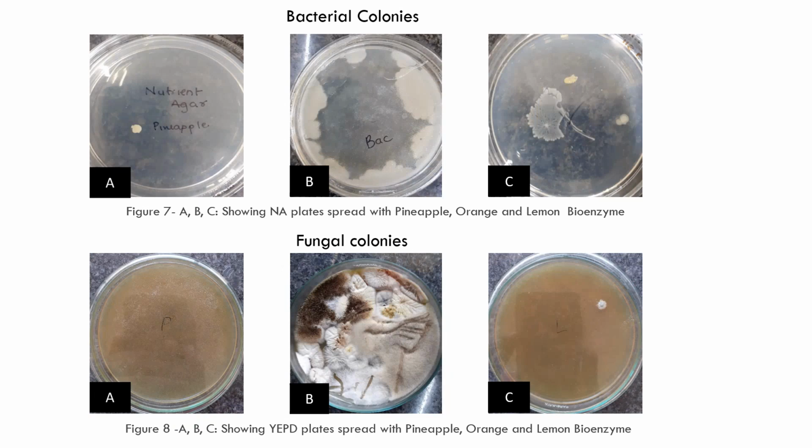The microbial composition inside the bioenzyme solution was done using spread plate method. The serially diluted solutions were used.